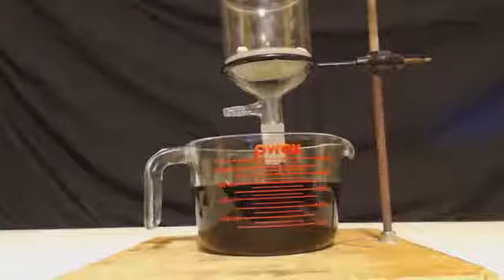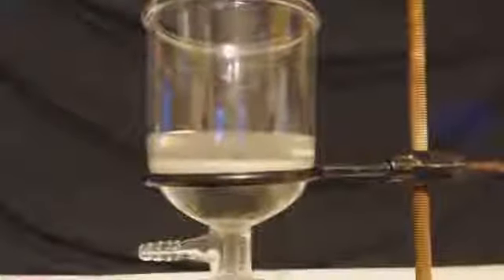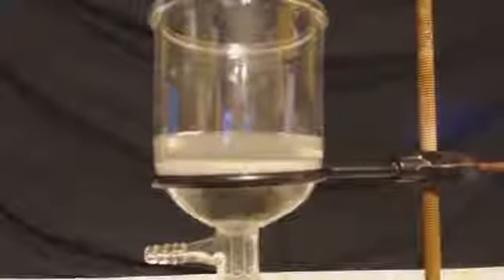I didn't use a vacuum. I just let it drip in there. Ended up with about 800 milliliters of liquid there. You can see right there the gray. That's actually white on the bottom of there, but the gray layer is the chromium powder. And you can see I threw some more water in there, and none of it turned green. It just turned gray, and that's due to the powders floating through the water there. If I let it sit, it'd clear up.